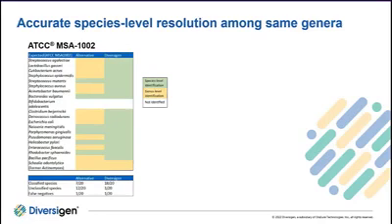This also means that 12 out of the 20 bacteria were not classified at the species level when using the other approach, and only 1 bacterium was not classified at the species level when using our approach. This also means that there was 1 false negative when looking at both approaches. This may be due to a number of different factors, including, for example, biases related to primer amplification.